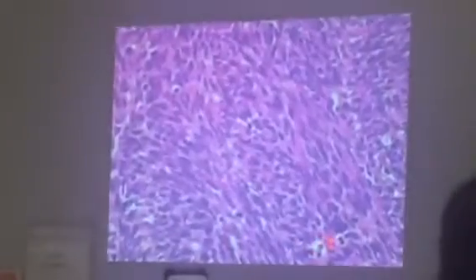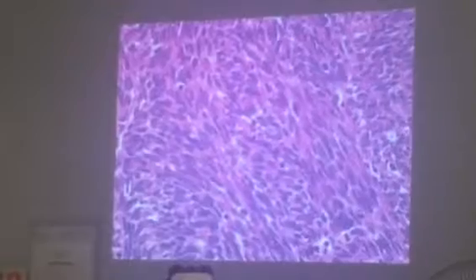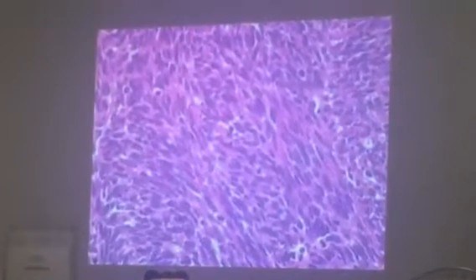These are mitotic figures actually. Okay? Yan. This is leiomyosarcoma. Okay? Compared to leiomyoma. You see the difference? Mas plump yung nucleus compared to leiomyoma. Another thing is that it's more cellular. Mas magkakalapit yung mga nuclei. And of course, you can count the mitotic figures here.